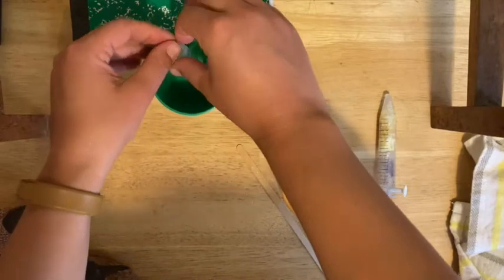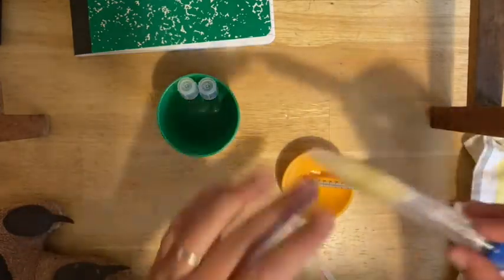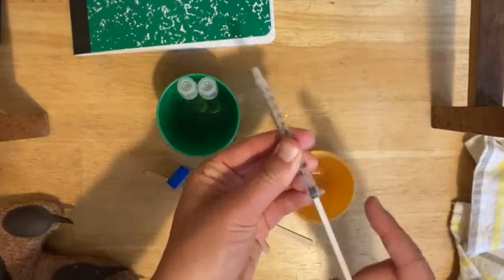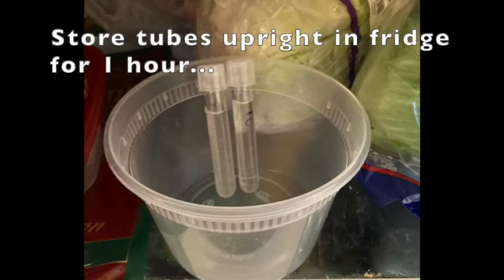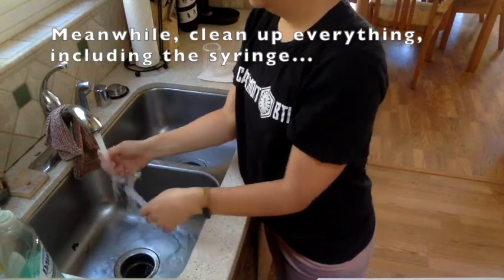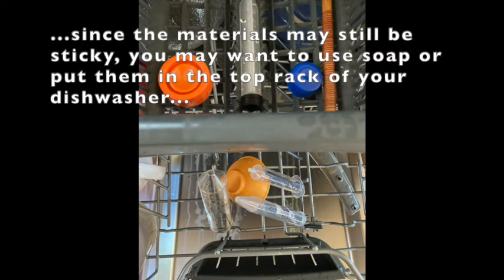These two tubes need to go into the refrigerator for at least an hour, and then you're going to check them. Everything else should be cleaned and thrown away. The tube and wooden stir stick can be thrown out. The syringe should be separated and rinsed thoroughly, or run through the dishwasher to remove any sticky sweet residue. Place the tubes upright in your refrigerator for one hour and set a timer on your phone. While you're waiting, clean everything else up. You may want to put everything in the dishwasher since it was pretty sticky. Also clean your lab workspace.